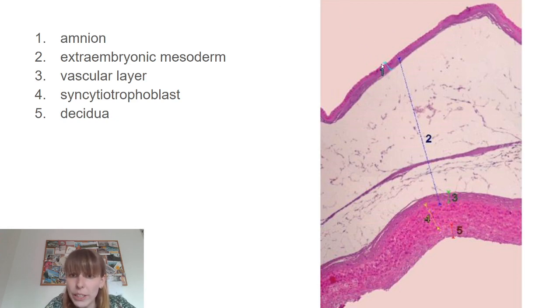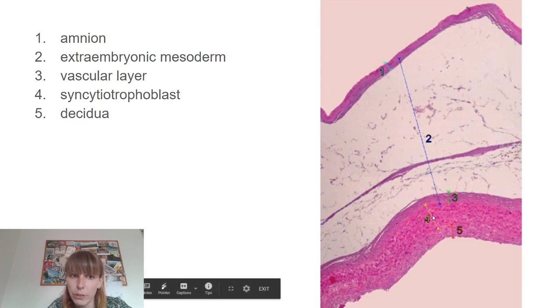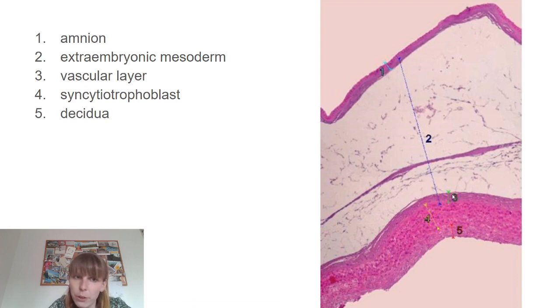And so here we will zoom in even more, but here we will have the amniotic epithelium, then all of this will be the extraembryonic mesoderm, so all of the connective tissue with the loose bits, and here as well will be the extraembryonic mesoderm of amnion and of chorion. And then you have the so-called vascular layer, that's part of the chorion already. It's not terribly important.